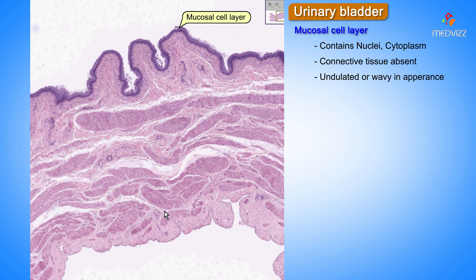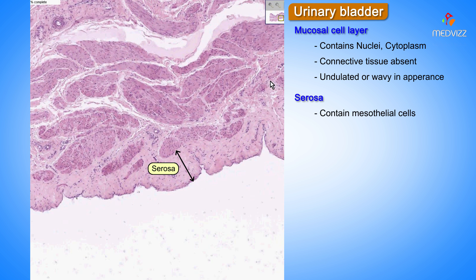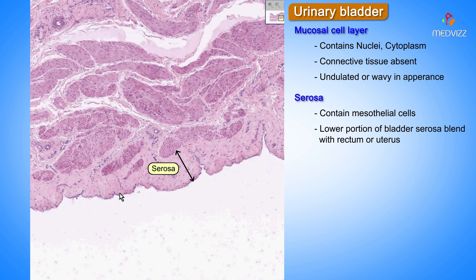The smooth muscle bundles are arranged for detruzing or squeezing out the urine, which is why it's also called the detrusor muscle. Notice we have some connective tissue out here, and notice that the top part of the bladder, or the superior part, is covered by serosa, so you may very likely find some mesothelial cells along here. Otherwise, the lower portions of the bladder kind of blend in with either the rectum or the uterus, and you're not likely to see any serosa in the inferior portions of the bladder.